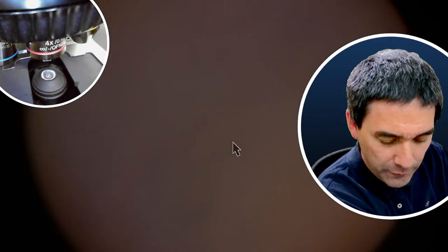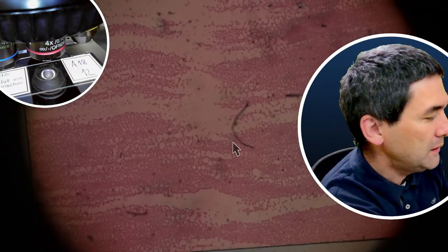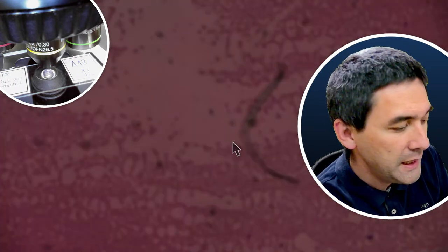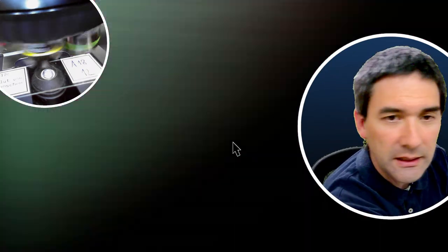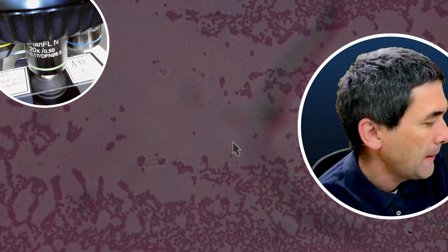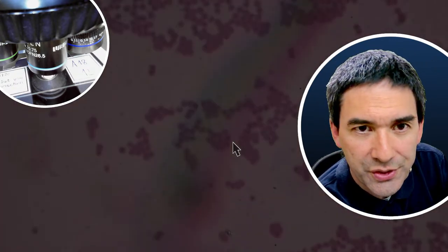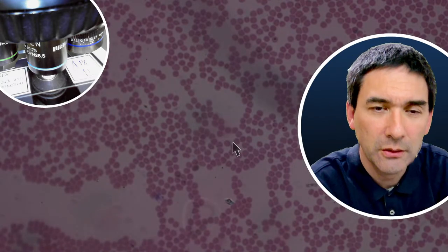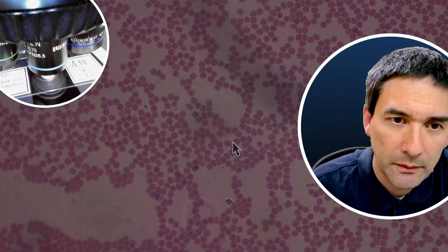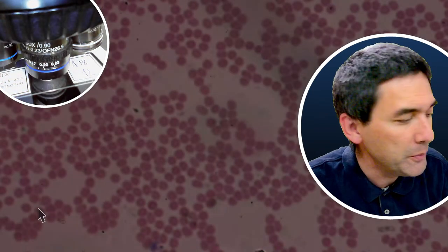But let me finish this here first, because the next thing that I want to show you is human blood. If you've been watching my videos, many people put blood under the microscope, and mostly you see red blood cells, but I think this does not look very interesting. Gotta be very honest with you, because this is a permanent slide, and this is how it looks. Those circles are red blood cells. And red blood cells are quite delicate. It means they like to lose their shape quite easily.